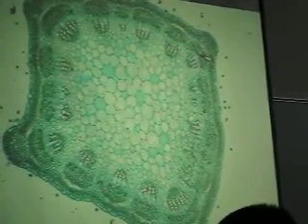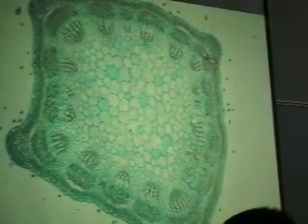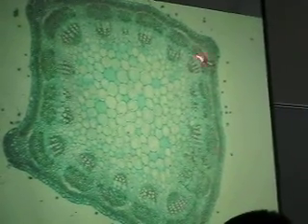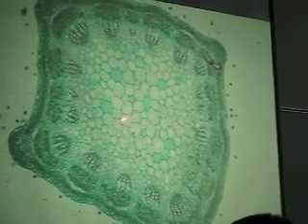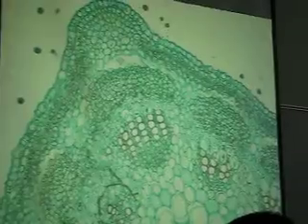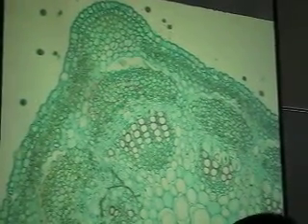Okay. Number 7, dicot stem, eustele. How do you know it's a stem? You got multiple vascular bundles. How do we know it's a dicot? There is a pith in the middle. Okay. And the bundle cap is sclerenchyma, even though it's stained green, it's sclerenchyma. And that's sclerenchyma, and then we have the xylem here, and then the phloem here. The phloem here and the xylem internal. Xylem is the inside. Xylem, phloem.